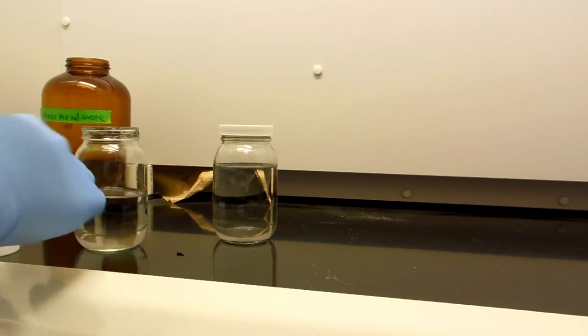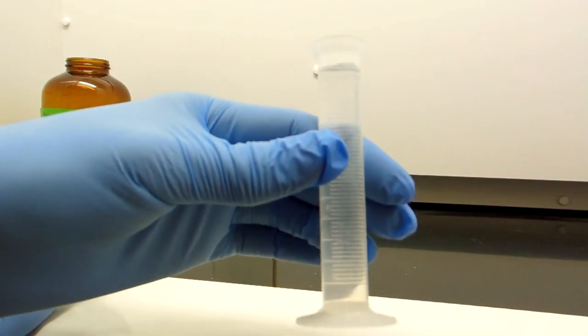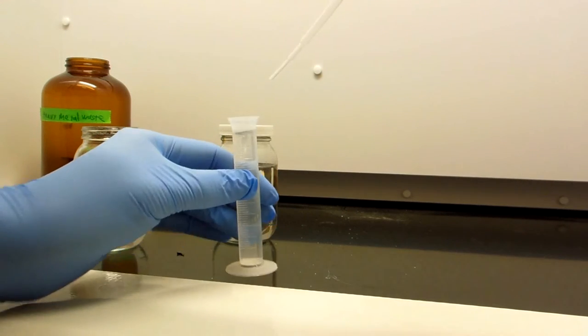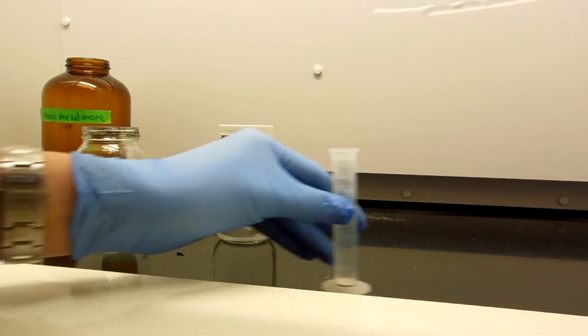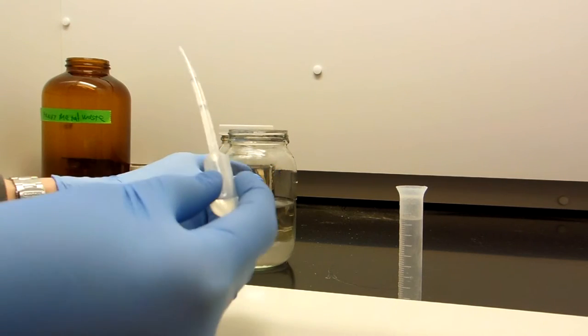The next step involves the use of sodium chloride that's been dissolved in water, putting in an aqueous solution. I used some non-iodized salt for this. It filtered out the solids, as there is an anti-caking agent present that does not dissolve in water that could contaminate the solution I'm adding this to. I first use 10 milliliters with a 10 milliliter graduated cylinder and draw the liquid using a plastic pipette.